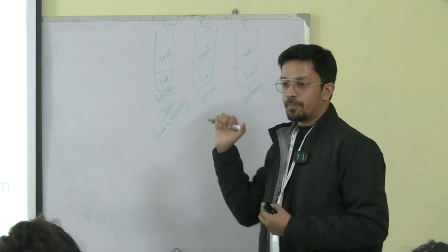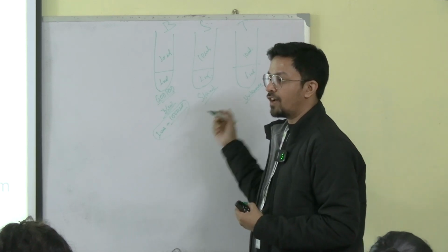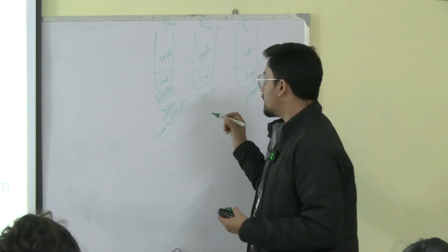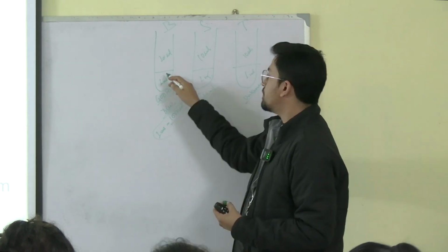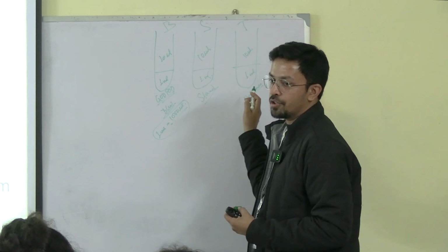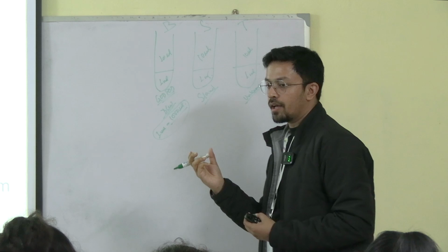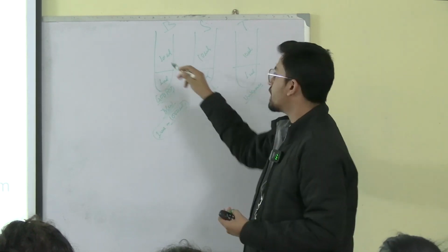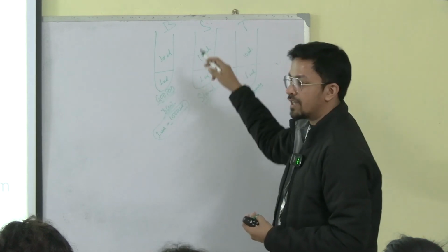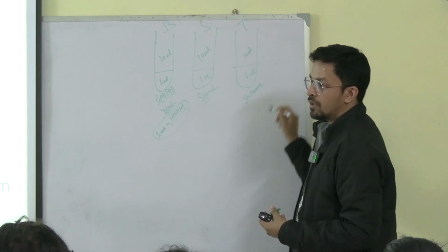Now when you see the pipettes, you always have to look at the valuation on the pipette. If it is written 1000 microliter, that is 1 ml, and that much amount you have to take in the 3 test tubes. Then there are other pipettes for smaller amounts of pipetting. Over there you will fix 10 microliters, and first you will take the blank, that is the distilled water, then 10 microliters of the standard, and then 10 microliters of the unknown sample.